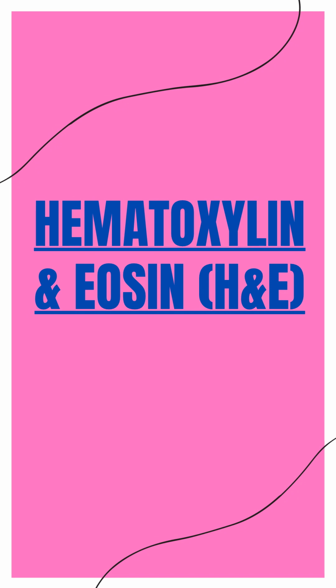3. Collagen fibers. Connective tissues, which contain collagen fibers, are stained pink by eosin. The presence and arrangement of collagen fibers are essential in diagnosing various connective tissue disorders. 4. Extracellular matrix. Components of the extracellular matrix, such as mucin or amyloid deposits, may also exhibit characteristic staining patterns under H&E, aiding in the identification of specific pathological conditions.